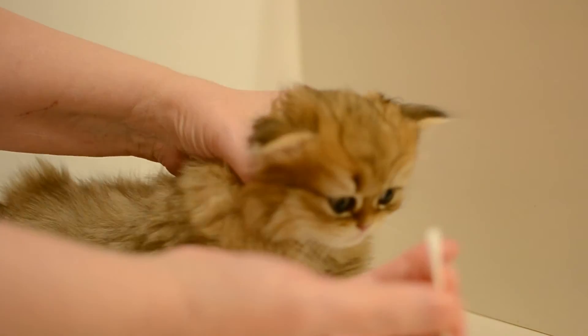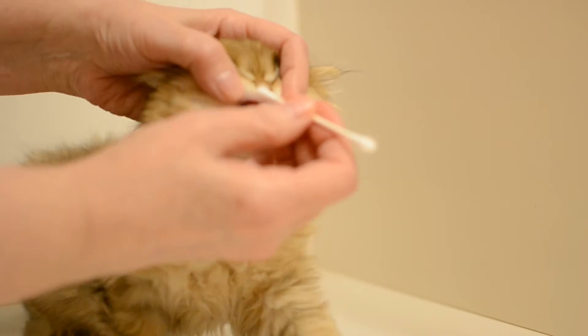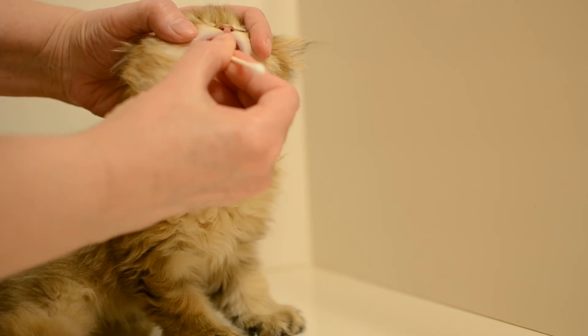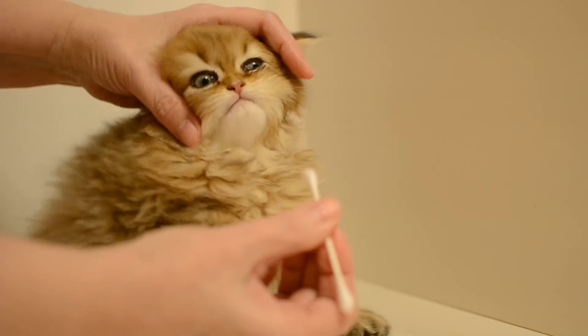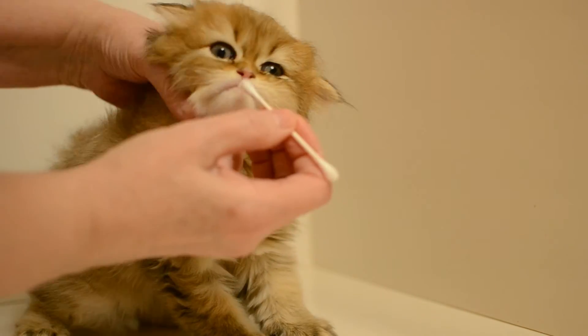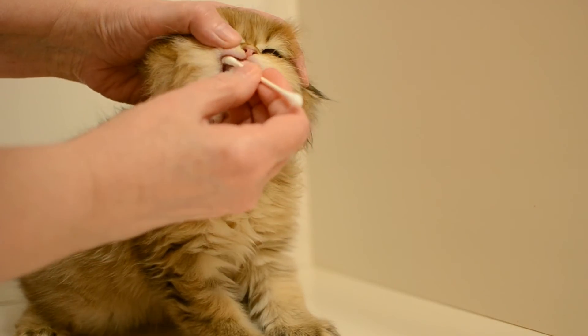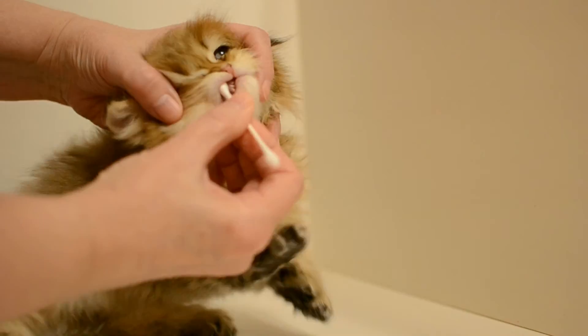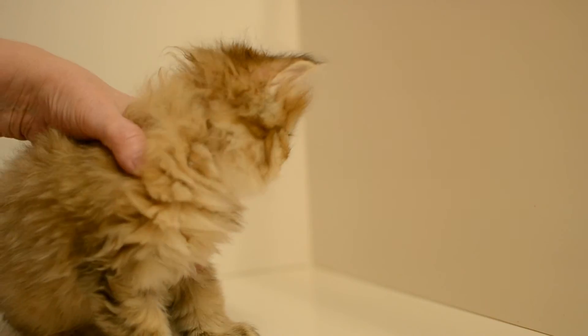You're being good. A little bit more — we want to make sure we do a good job so we get the results we're looking for. Okay, that should be enough and that's it.